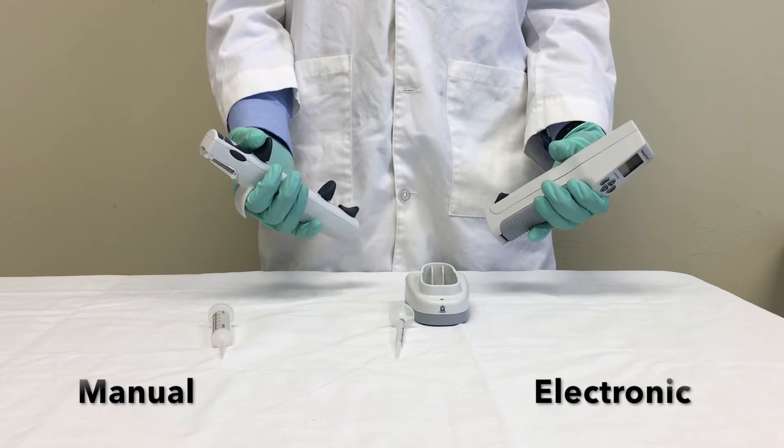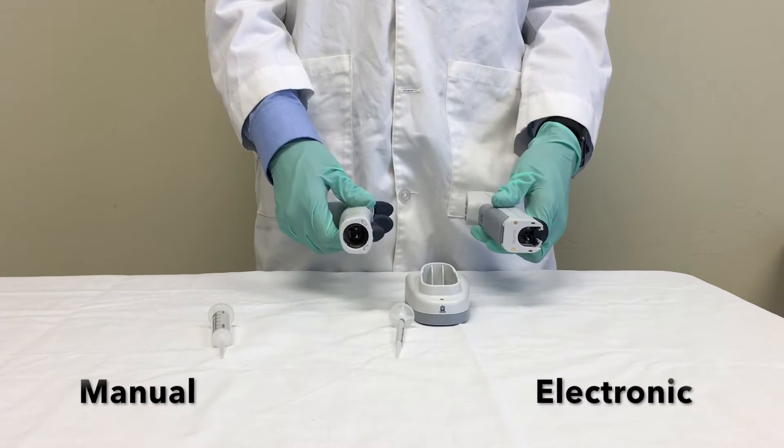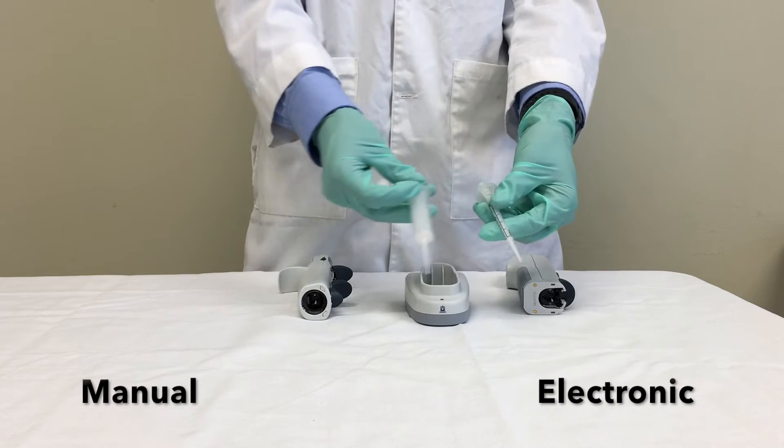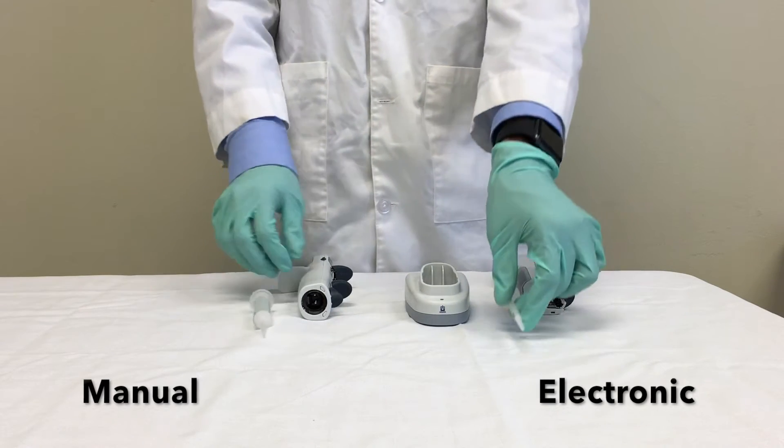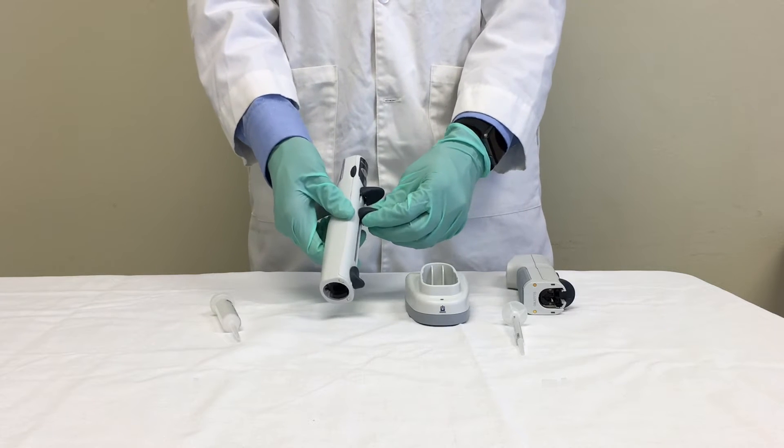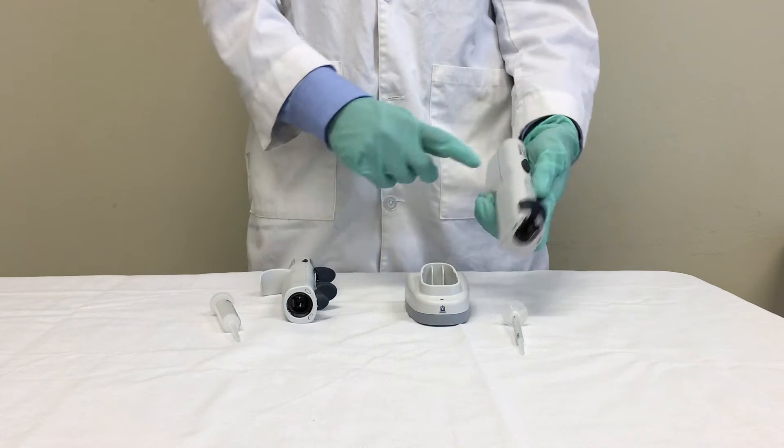The main difference between the two is how you set your pipette to dispense the volume you desire and the fact that the electronic requires no force when filling up the tip and dispensing, whereas the manual requires you to pull up on the filling lever to fill up your tip. Both are compatible with all different sizes and brands of pipette tips.